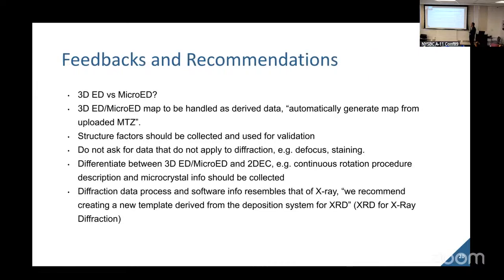First things first, 3D ED versus MicroED. When we sent out the initial proposal, everything was MicroED. And we received pushback from most European and Japanese scientists. They claim 3D ED is the standard term for this technique. So what we are going to do is use them both, and we're not going to make a choice. So everything you see on my slide, if you don't see 3D ED or MicroED, that's my problem. I make sure it's a good representation of the entire community.